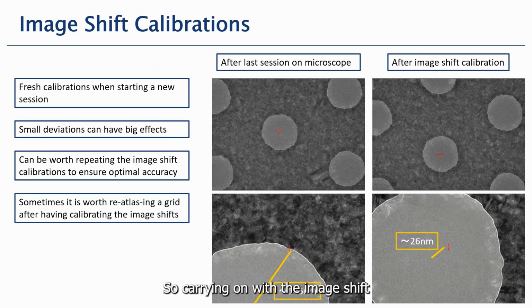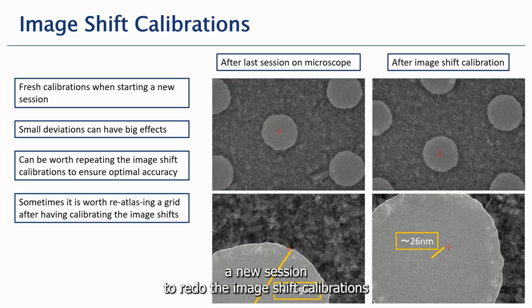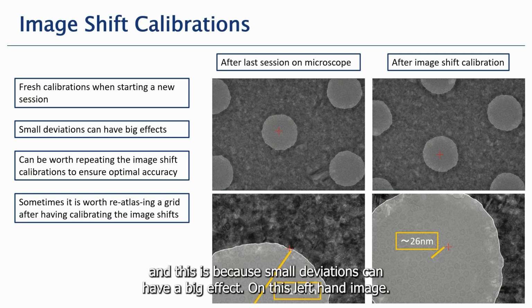So carrying on with the image shift calibrations, we would suggest that it's really important when you're starting a new session to redo the image shift calibrations. And this is because small deviations can have a big effect.